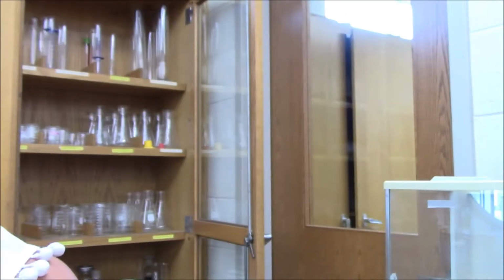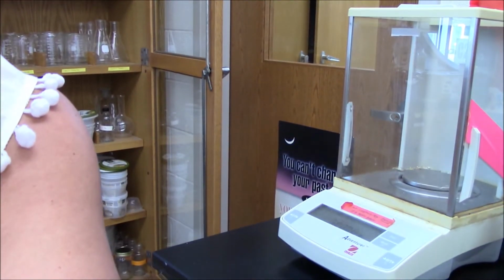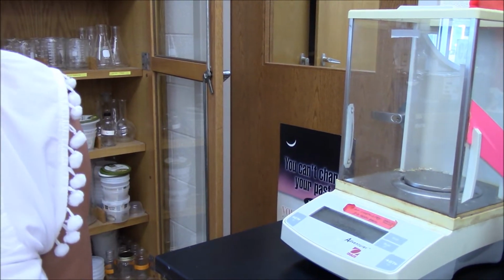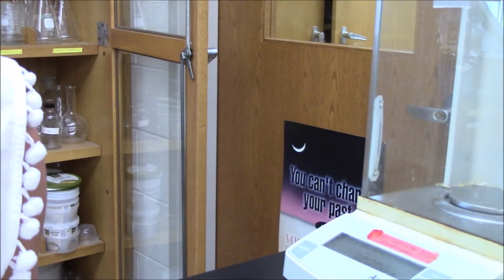In the first step, it says to weigh about 2 grams of sodium carbonate into a clean, dry beaker. I happen to be here, and I'm trying to move the camera. Of course, it's not going to move. Okay, there we go. Come on, move. All right.